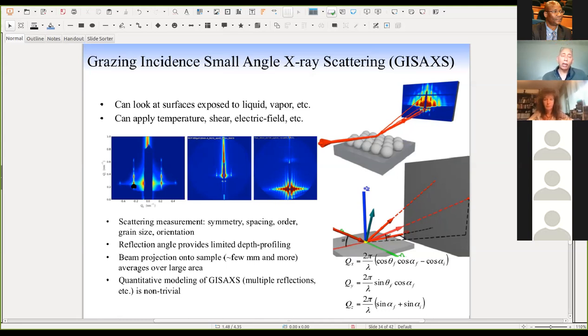And I would recommend that you set up to be efficient in the measurement process, so that you get the data you need before the sample is destroyed. Actually, one of the things in the experiment is to figure out whether the beam destroys the sample. You just put the beam on and see how the structure is changing with time. That will give you a sense of how much time you have to take the data. So you try, and if you've hit the point where the sample is destroyed, you have to put a new one in if you didn't get the piece of data you wanted. Okay, thank you. That's my recommendation.